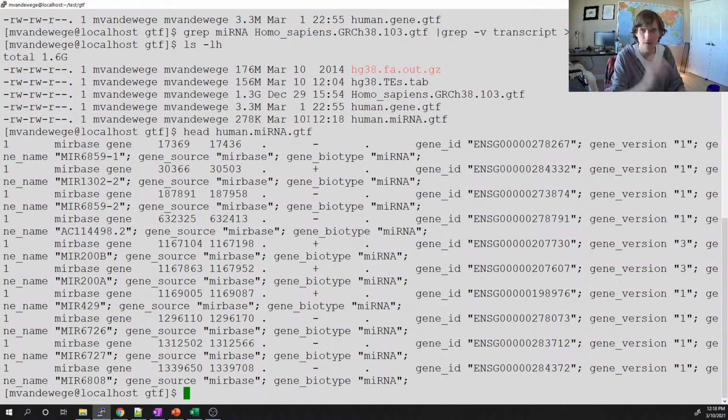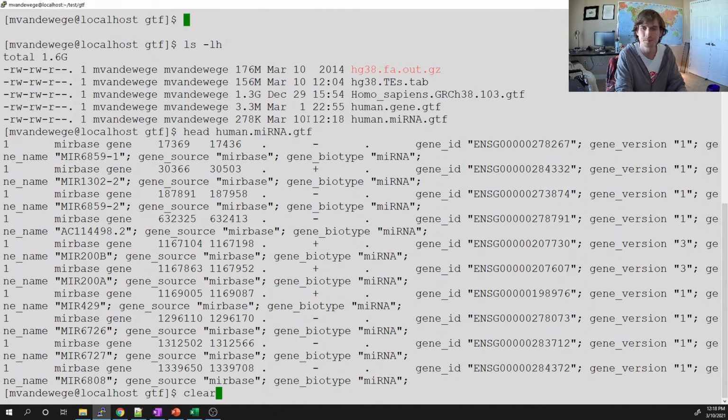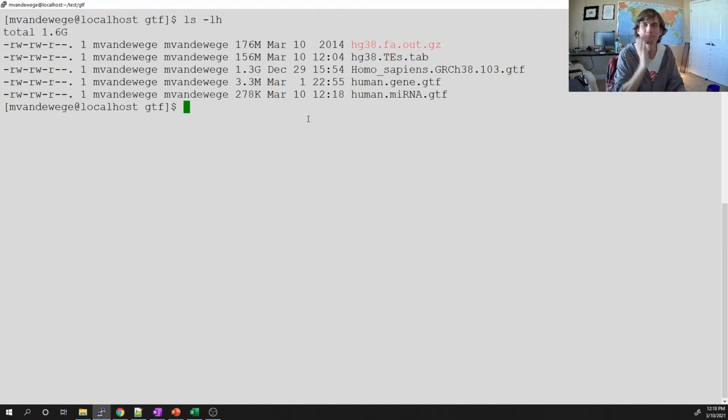Yeah, there they all are. And so just from this one file and just understanding one command, we can find and have ready for processing all of the microRNA annotations, at least those present in Ensembl. Fancy. What else can we learn about these?